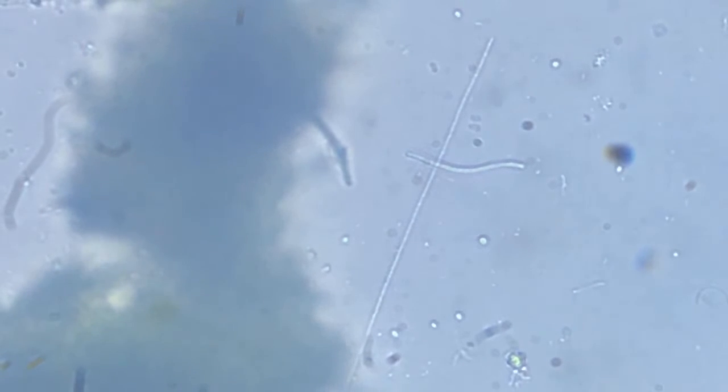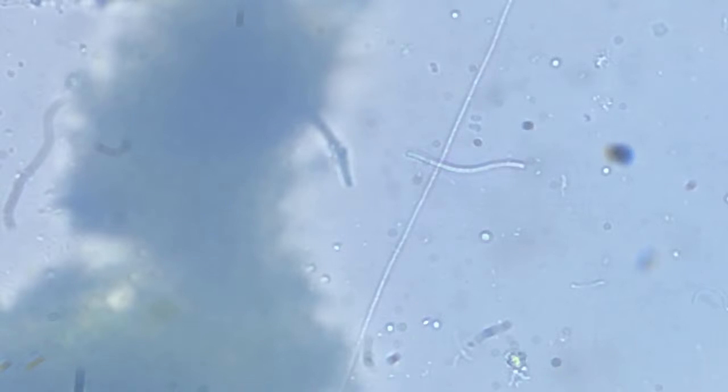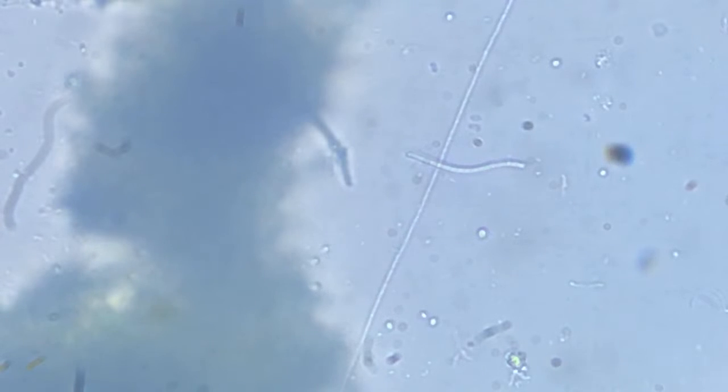I've tried searching literature for any organism like this. The best I came across were threadworms, pinworms, hookworms, but they don't fit this criteria. Given its diameter, it's extremely long.